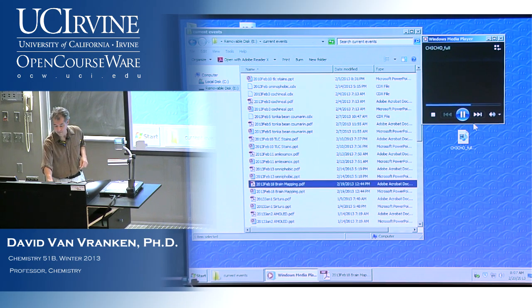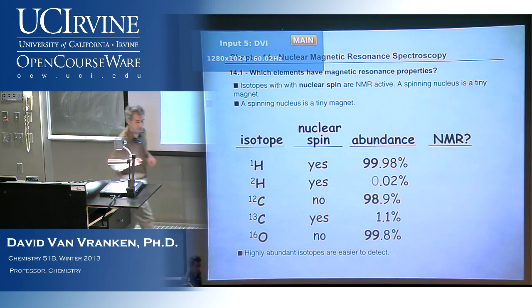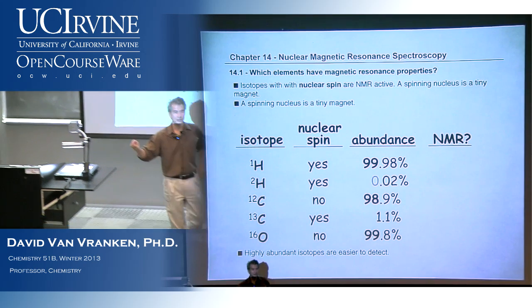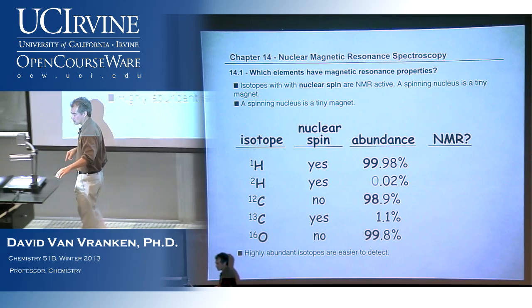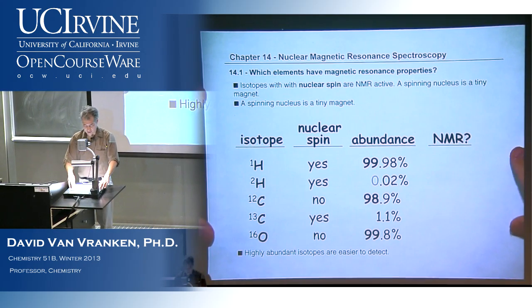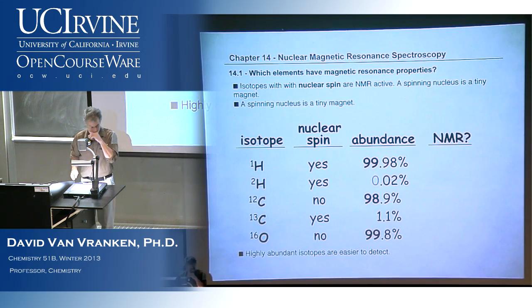You're listening to an organic molecule right now. This is an NMR. So when I was a graduate student and I used to take NMRs, I used to always run the NMR spectrometer with a little speaker on so I could hear my molecules each time, and I'll explain what that little pulse was about just momentarily. So I apologize for the volume on there, but maybe that'll help us wake up this morning.